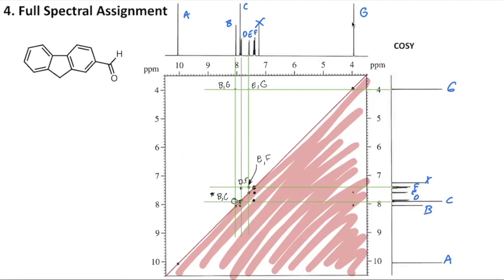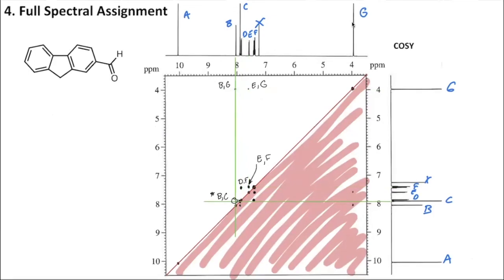So now that we think we have our cross peaks pretty much figured out, I'm going to go ahead and erase these lines, or at least most of them. I do want to leave one or two so that I can double check that cross peak at BC, just to see if we can make sure that it is C and not D. So I'm going to remove most of these lines, but leave a couple so that we can narrow in on this particular cross peak a little bit more carefully. So I'm going to zoom in a little bit more on this region of interest, just so that we can look more carefully at these peaks right in that central region that line up with C and D.